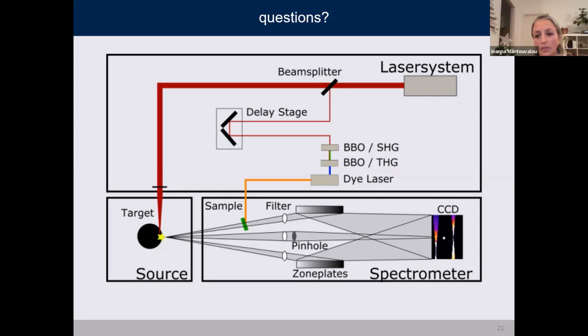They have very, very interesting and working examples, but the problem always is for us that we can't use that because they're only using a very small part of their window. That's what I was going to ask. It sounds like a lot of your trouble is that your spot size is not small. How big is this spot size on the sample?